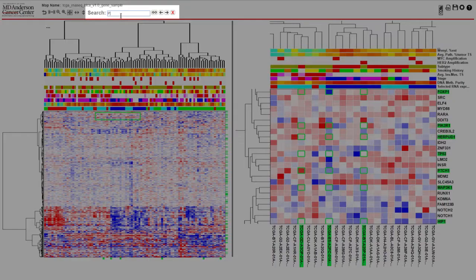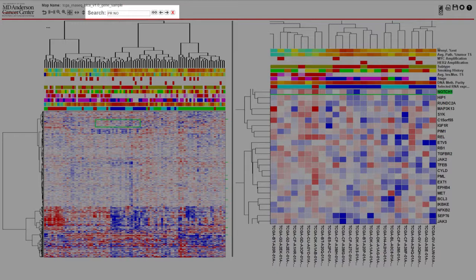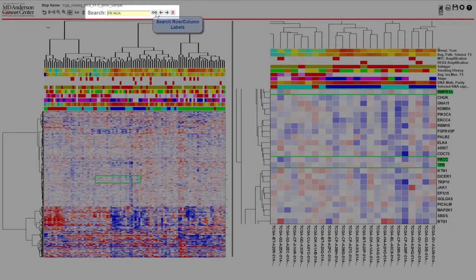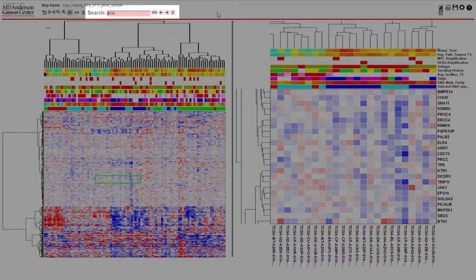You can search for multiple terms by separating them with a space. The search box itself will also display either a yellow color when some of your search terms return no match, or red when all of your search terms return no match.